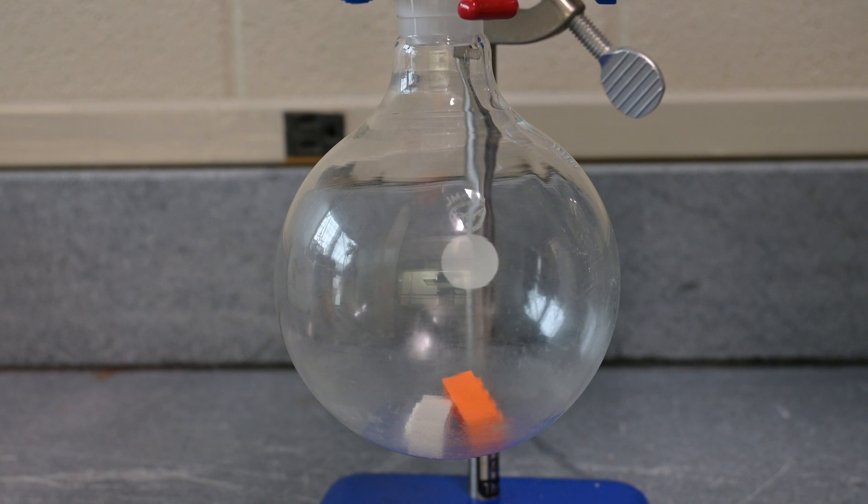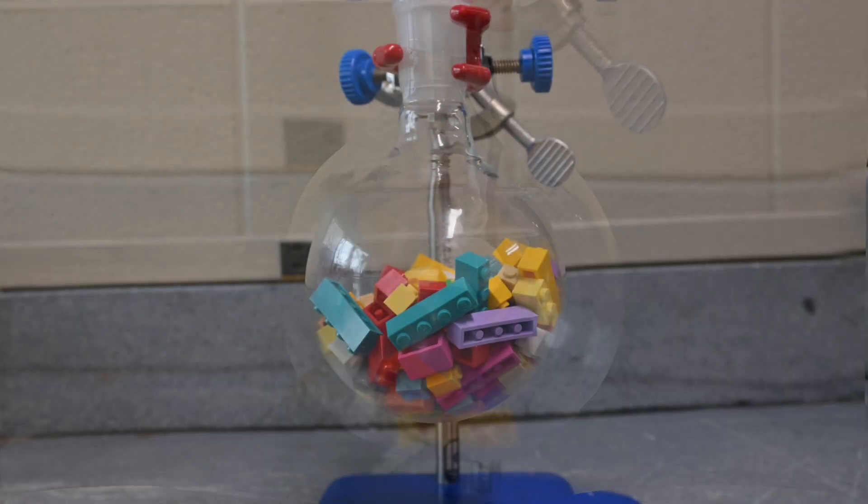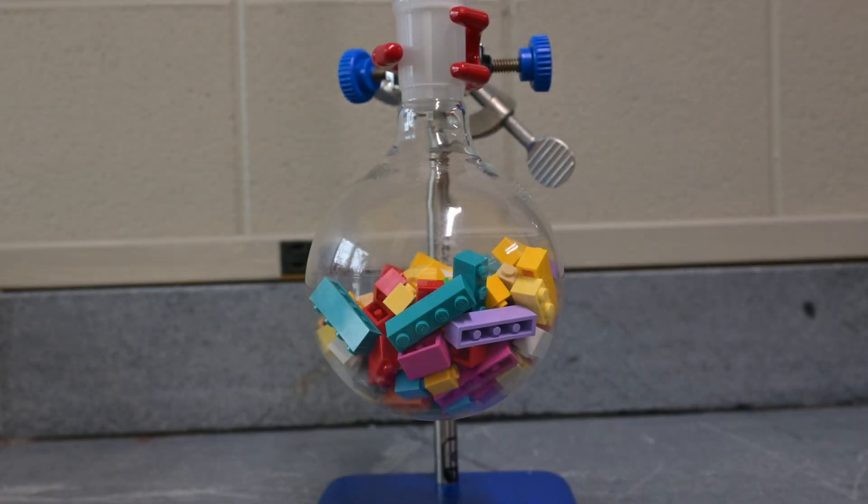First, the lego bricks were loaded into a round bottom flask. Normally you wouldn't want to fill a flask past its halfway point, but since legos are mostly air, they'll shrink down significantly as they melt.